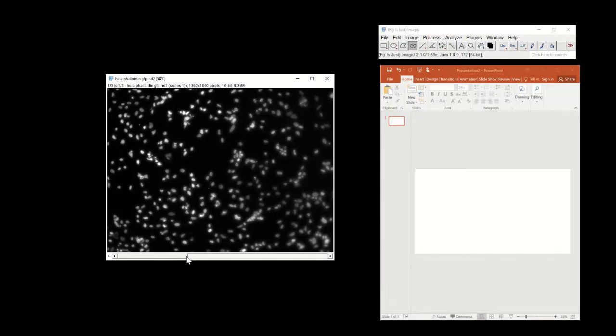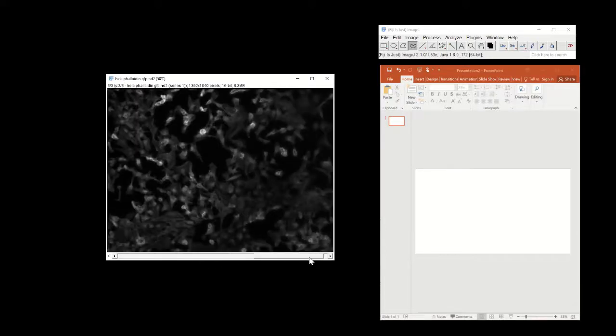Now you will note that the image that I'm using is a little bit blurry, and that's because I didn't clean the slides before the cover slips before imaging. But again, the focus of this tutorial is to learn how to analyze, and we will learn how to take beautiful images whenever we are in the lab. So again, we have three channels: the first channel, the second channel, and the third channel.